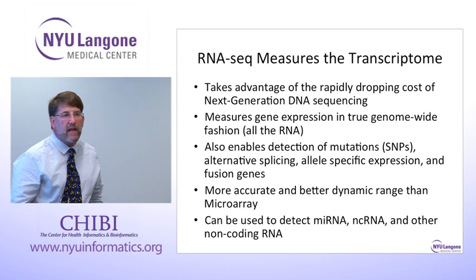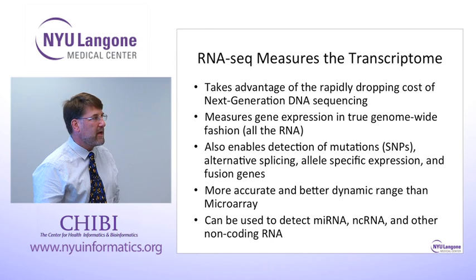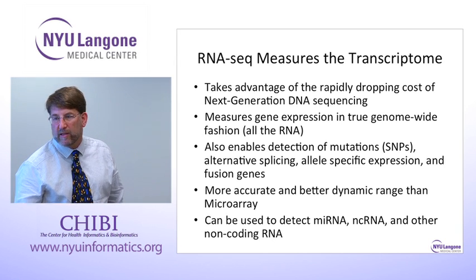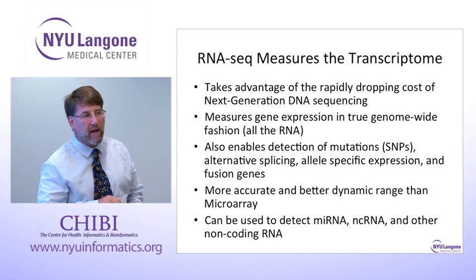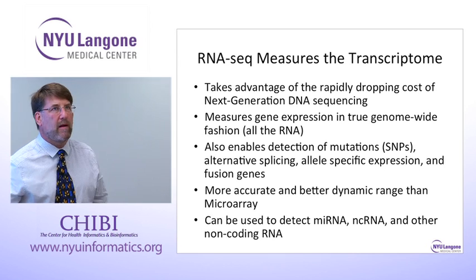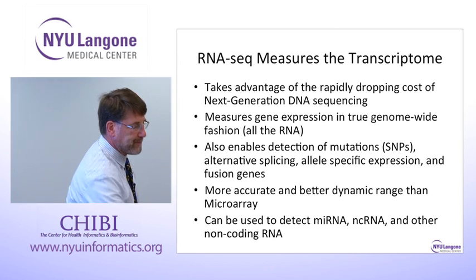Literature reports say that RNA sequencing is more accurate, and it definitely has a greater dynamic range than a microarray. It can also be used to detect small RNAs like microRNA, non-coding RNA, etc., although these targets are dependent on how you design your experiment.